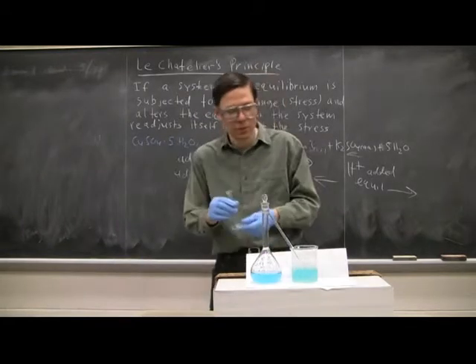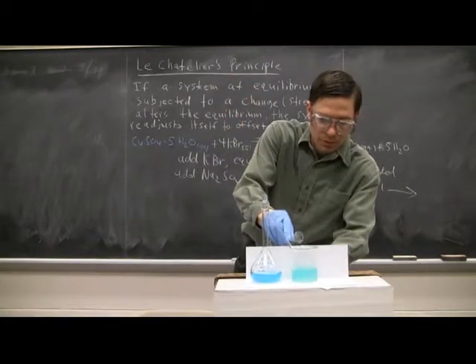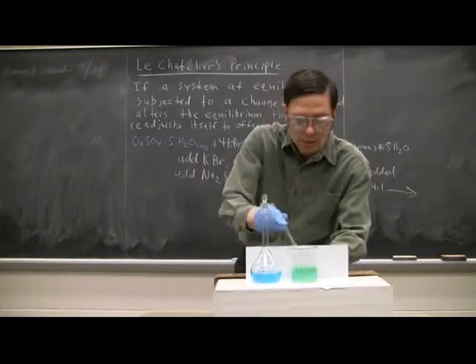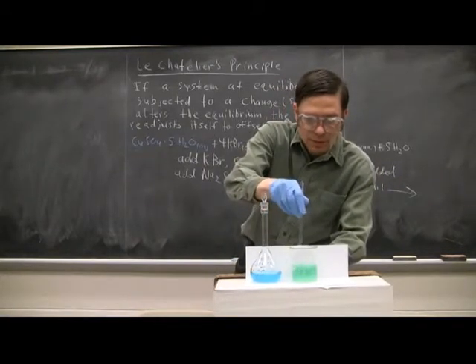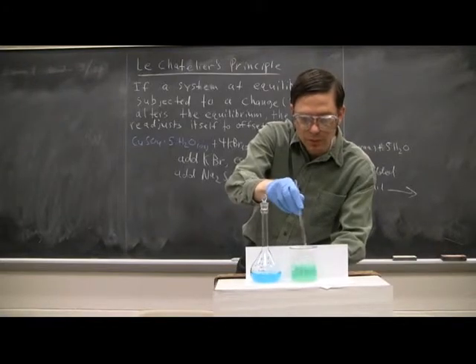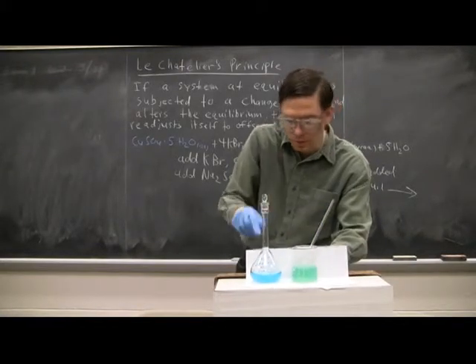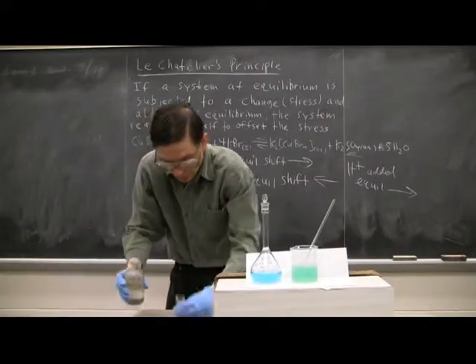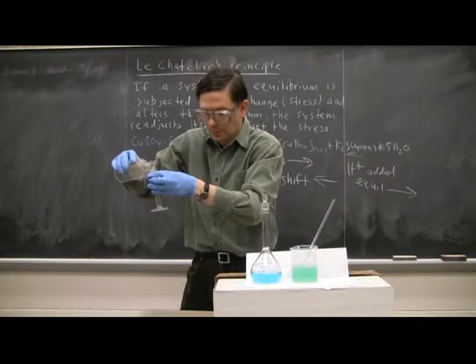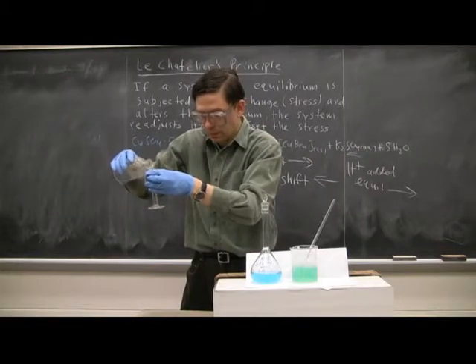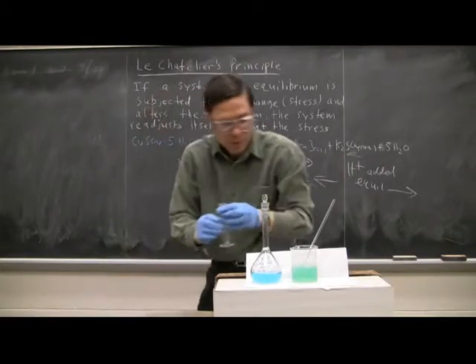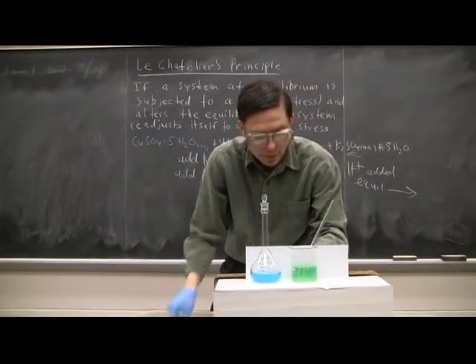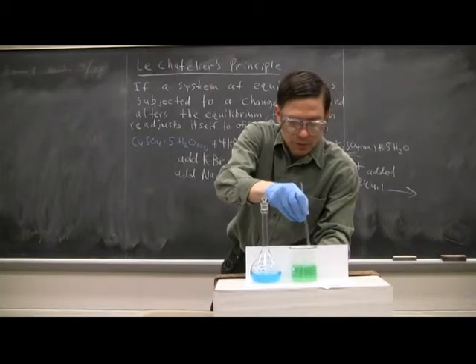I have 10 milliliters of hydrochloric acid. So let's just see what happens. And as expected, it went back to a green color. I'm just going to add just a little tiny bit more. I'll add another 5 milliliters. And looks like that's about as far as it's going to go.